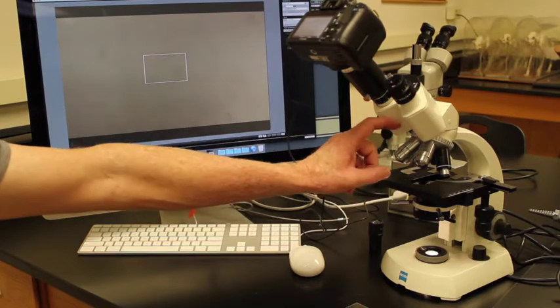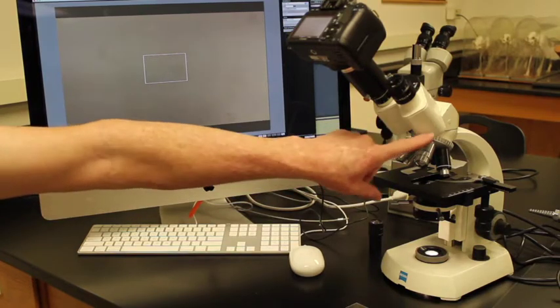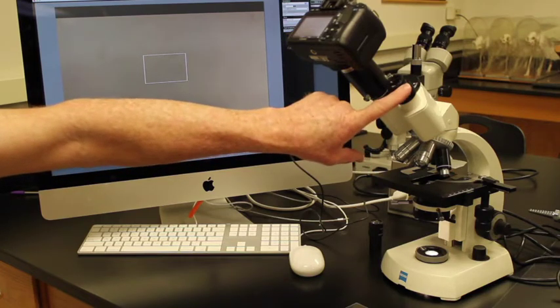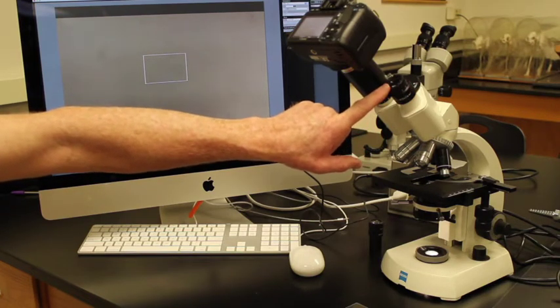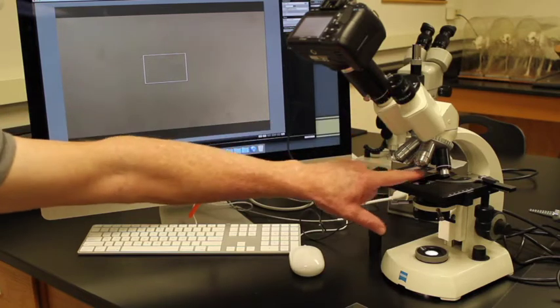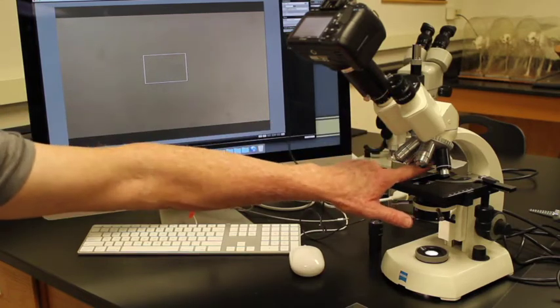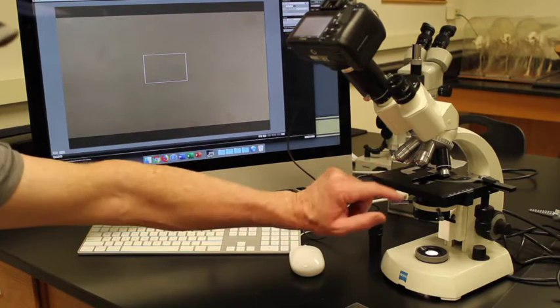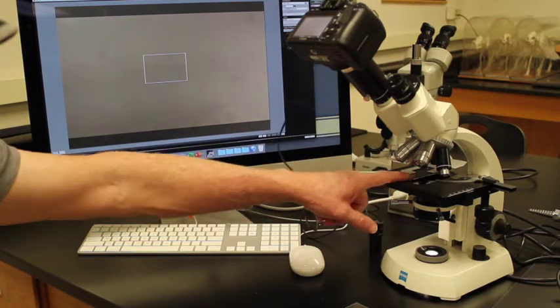It's transmitted up into one of these structures, which are called objectives. It then goes through this tube, bounces off a mirror, hits the ocular, and it's magnified again by this lens, which is a 10x ocular. Here we have various objectives. We have a 4x objective now in place. We always want to start with our lowest magnification in place, because then it's easy to move things on and off the stage.